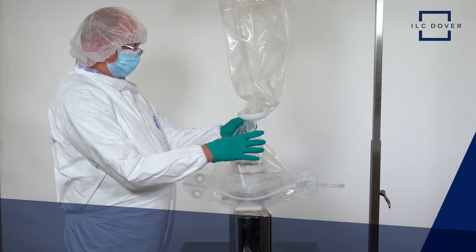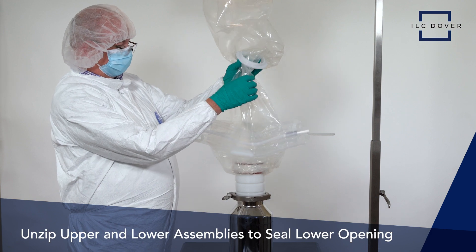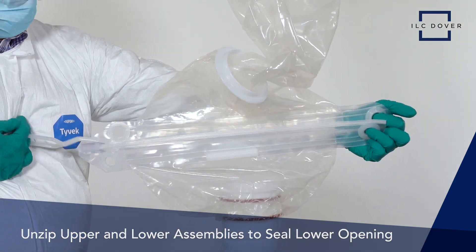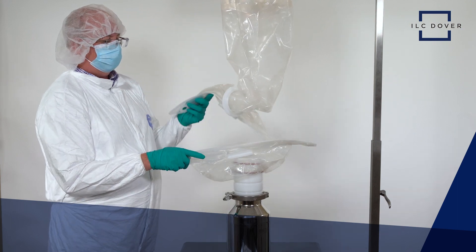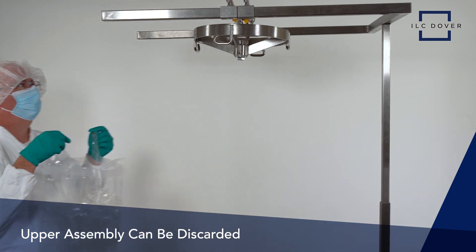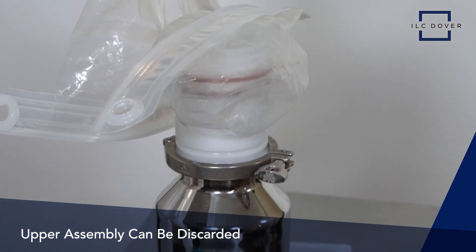Once the transfer is complete, unzip the upper and lower assemblies to seal the lower opening and maintain the integrity of the transferred powder. This completes the closed-loop transfer of powder using the EZ Biopack Zip solution. The upper assembly can now be discarded and the lower assembly is ready for another transfer.